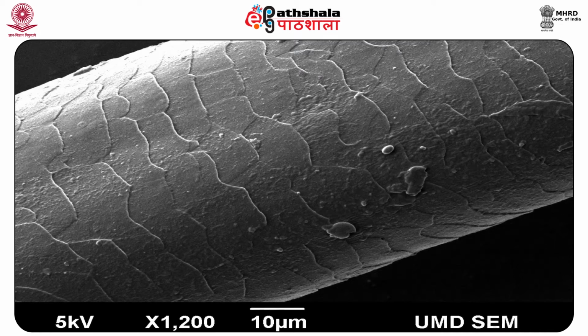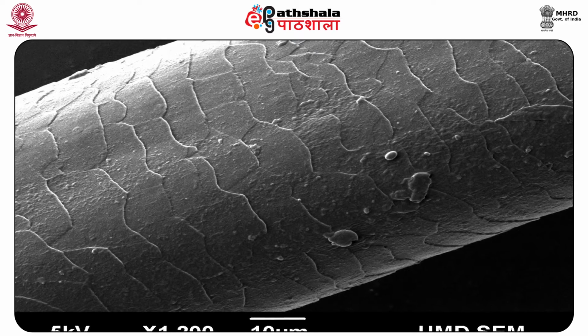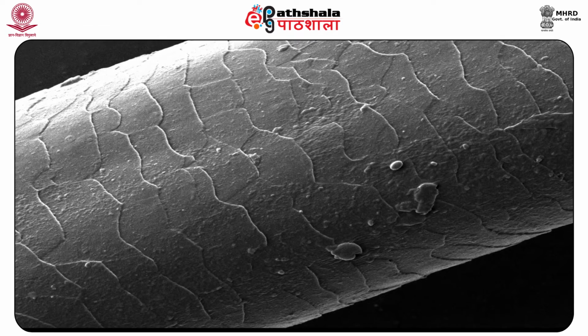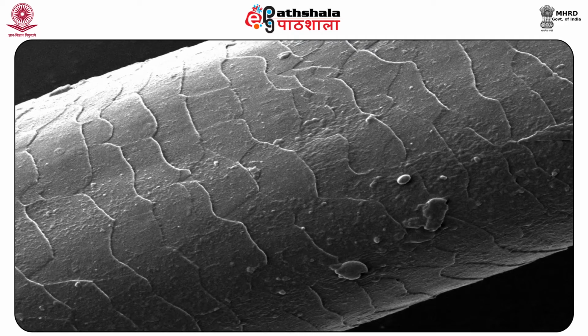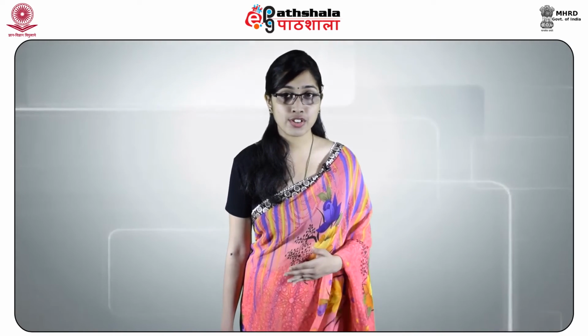For identification and examination of hair of high quality, the transmitted light microscope is required. The objectives and the eyepieces should permit observations in the range of approximately 40x to 400x. The examiner's ability to observe certain features is enhanced by using a polarized light microscope.